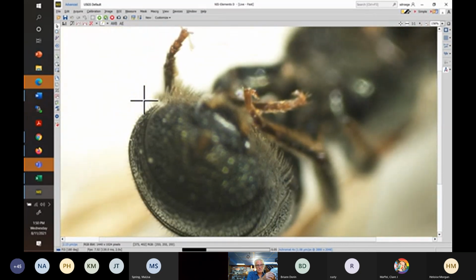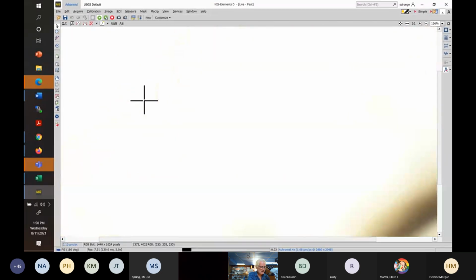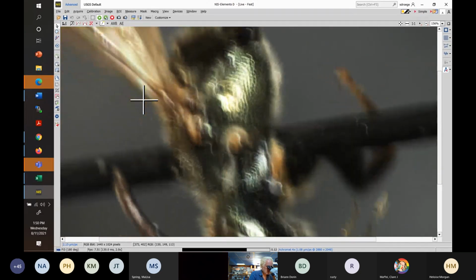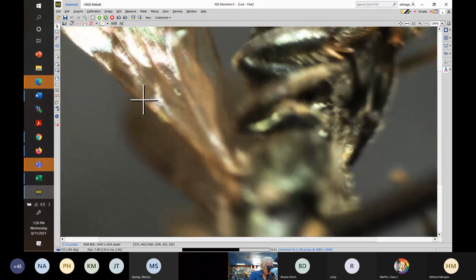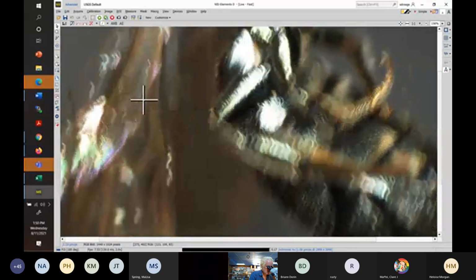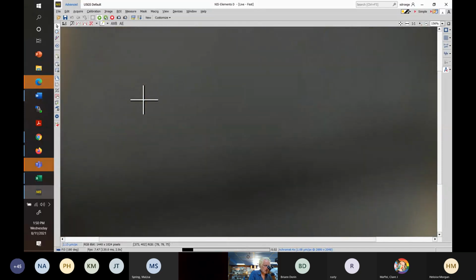But if we go now to the hind tibia, I'm going to try and find it before I show it, to try and locate it under the microscope myself. Let's see, I had two, but I think I want to use this side.